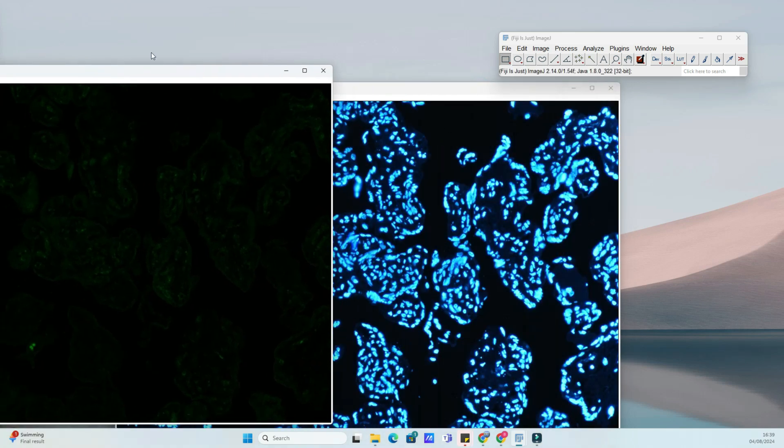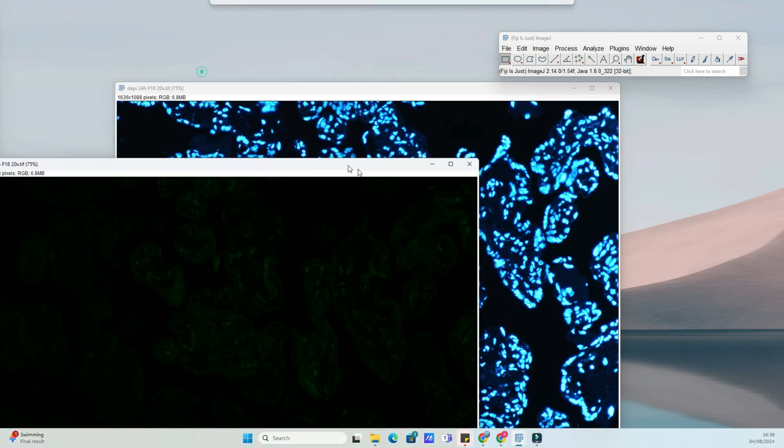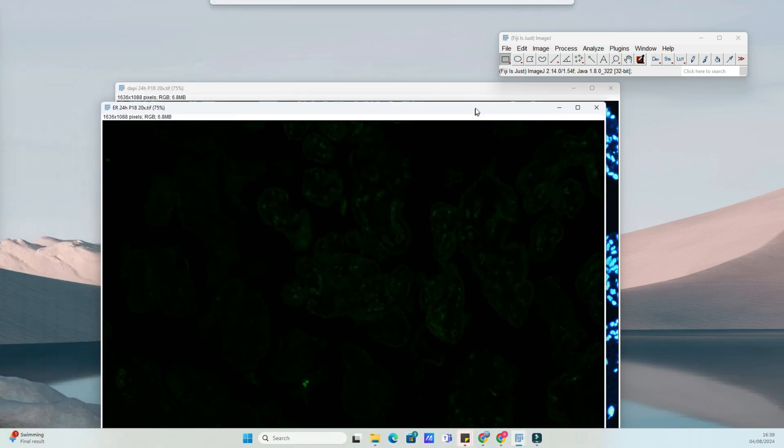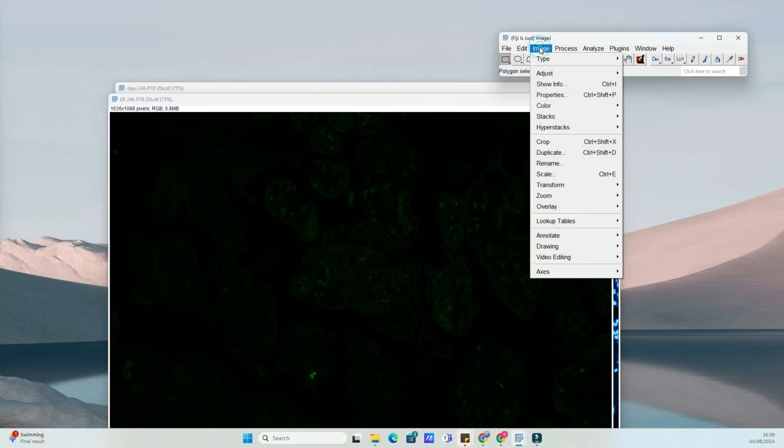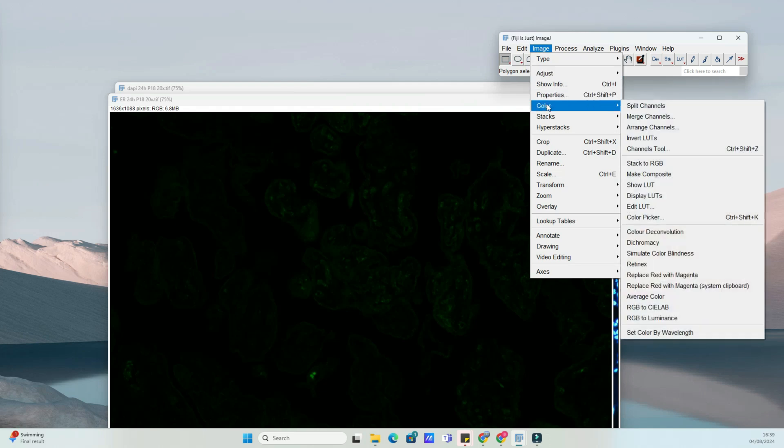First, let's open ImageJ. If you haven't installed it yet, download it from the official website and follow the installation instructions.